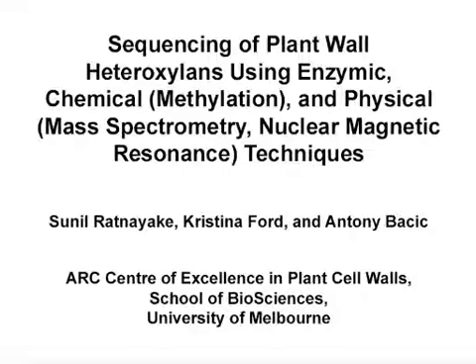The overall goal is to characterize the reducing end and internal region glycosyl sequences of heteroxylans by tagging the original reducing end sugar residue of the water-soluble arabinoxylans and treating with an endoxylanase to generate a mixture of labeled oligosaccharides.